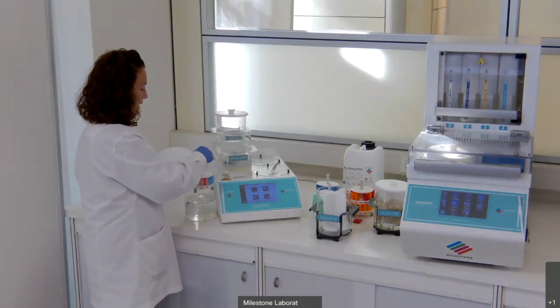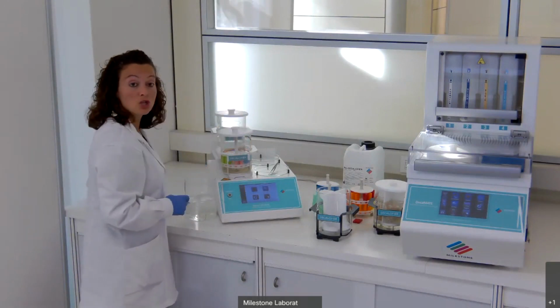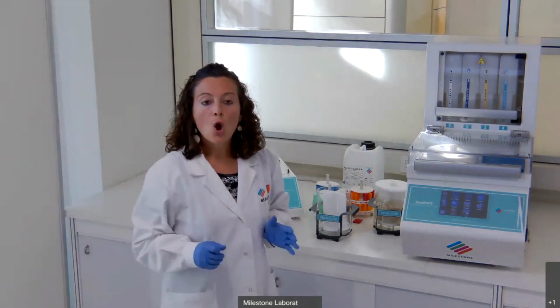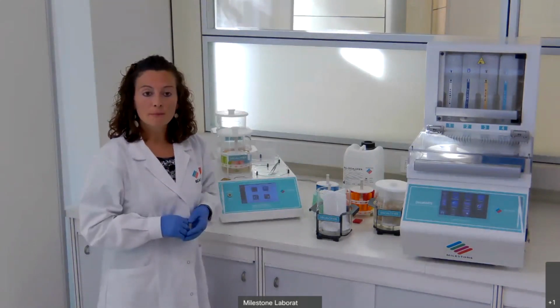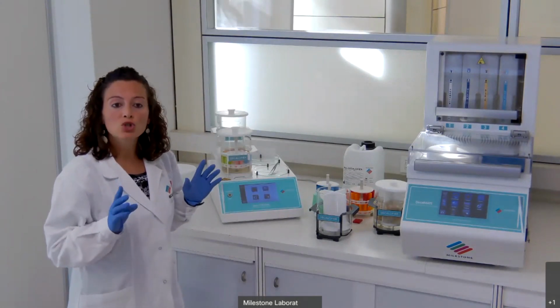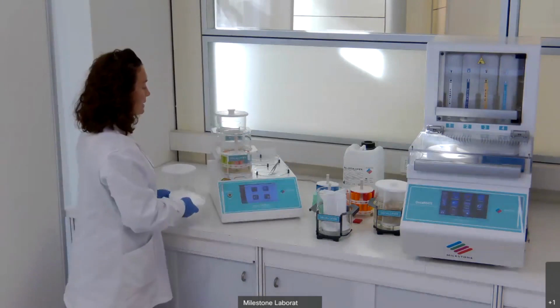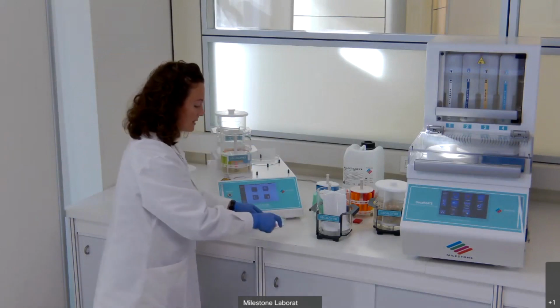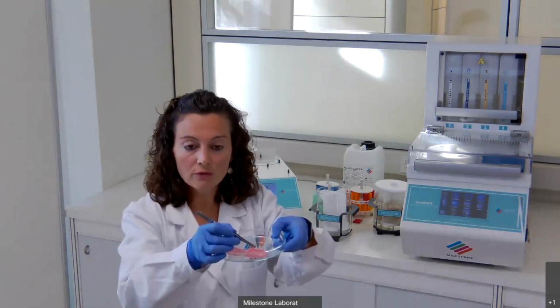Now, we can start our decalcification in the front position with time and temperature. When the unit reaches the time of the decalcification, it will emit a sound. It's possible to check the decalcification status in this lateral part. So the idea is to take out the specimen, open the cassette, and check the status of the decalcification.